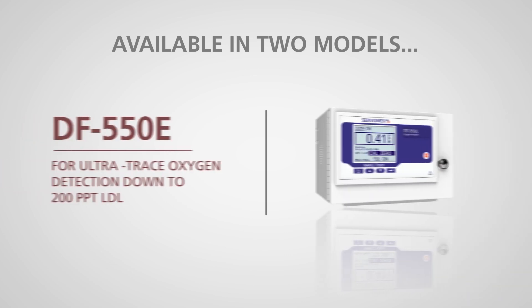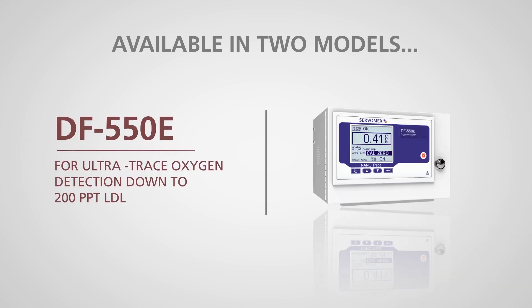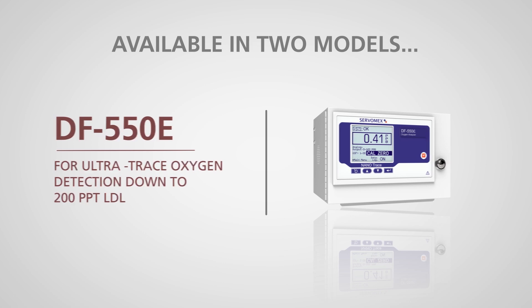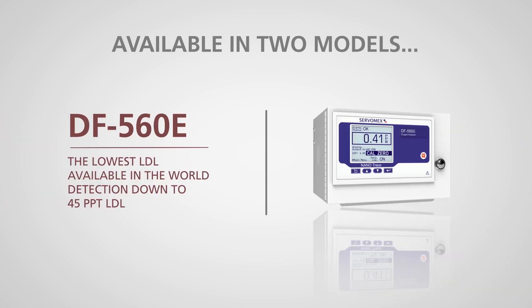The DF550E for Ultratrace measurement down to 200 PPT and the DF560E with a lower detection limit of 45 PPT, the lowest in the world.